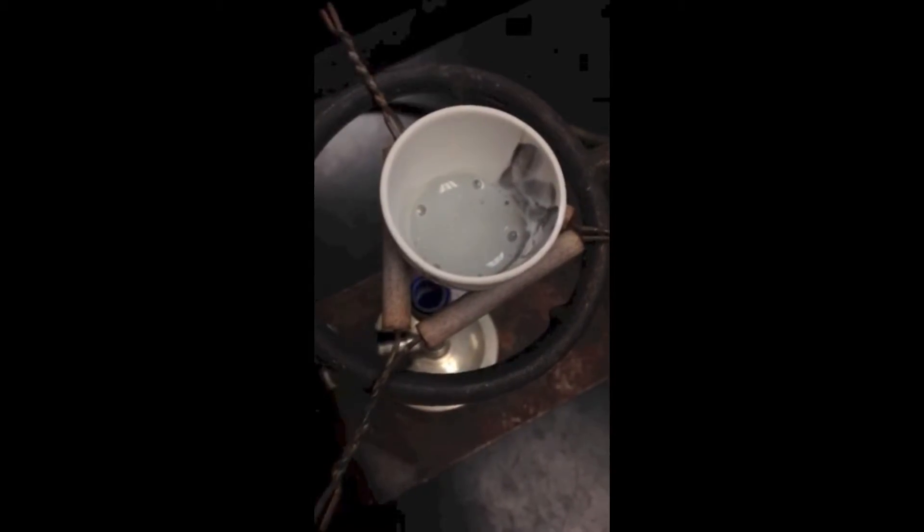We then placed 10 droplets of water into the crucible with the coil. Next we placed the crucible back onto the Bunsen burner, and we did not put the lid on like we had in other steps where we did not have the water in the crucible.